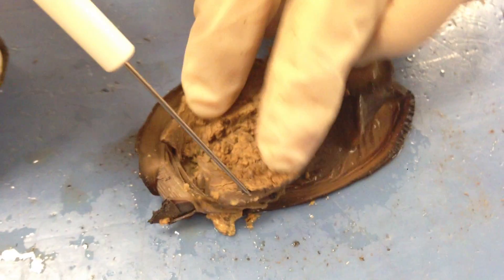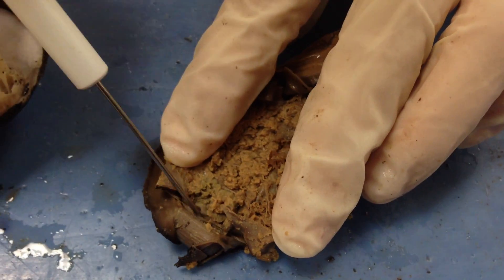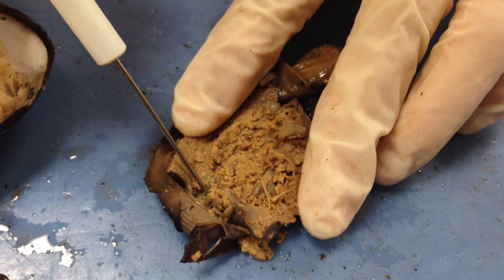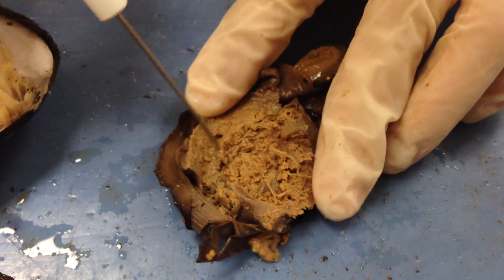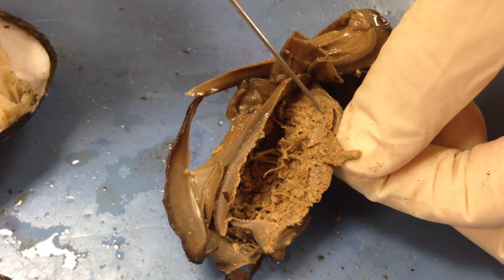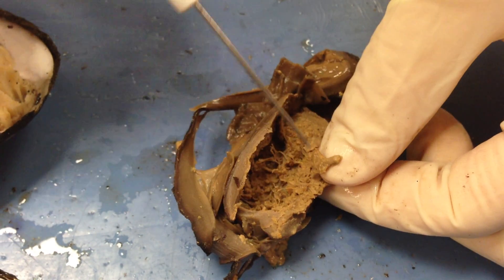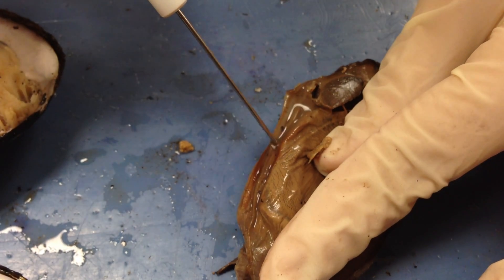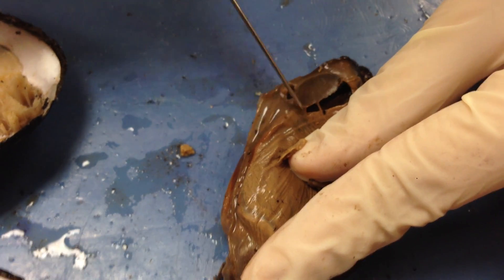When you cut this all open, just like we've done the other one, we open it up, and this is where the stomach is going to be, next to the digestive glands, which is the liver. The gonads are here, and then you can see the intestinal tract right here as it runs through this gland. It eventually loops through the visceral mass and comes back up along the top here, which then is excreted out the anus.